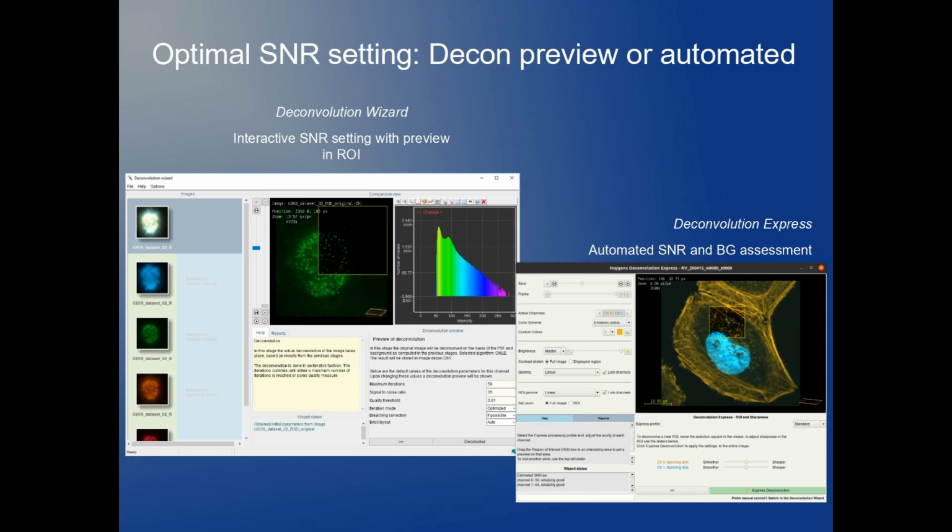Of course, we made these changes in the new Decon Wizard, but we made sure that results from previous templates do not change the outcome of the previous results. So we make sure that the previous results are still reproducible. So to show you how it now works in the Deconvolution Wizard, let me walk you through this updated Decon Wizard.